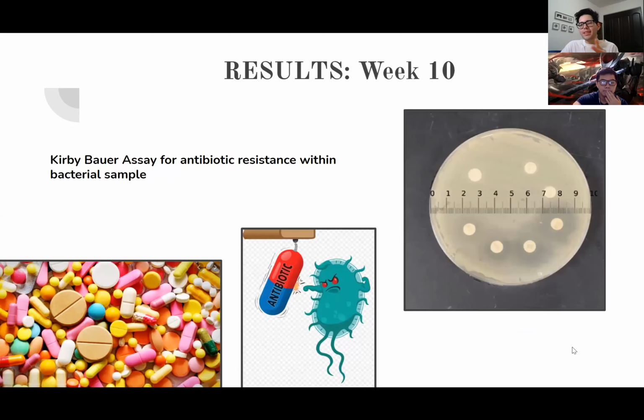In week 10, we did the antibiotic resistance with the Kirby-Bauer assay. And as you can see on the image right there, our bacteria was resistant to 3 antibiotics, being bacitracin, erythromycin, and penicillin, and susceptible to the other 3.